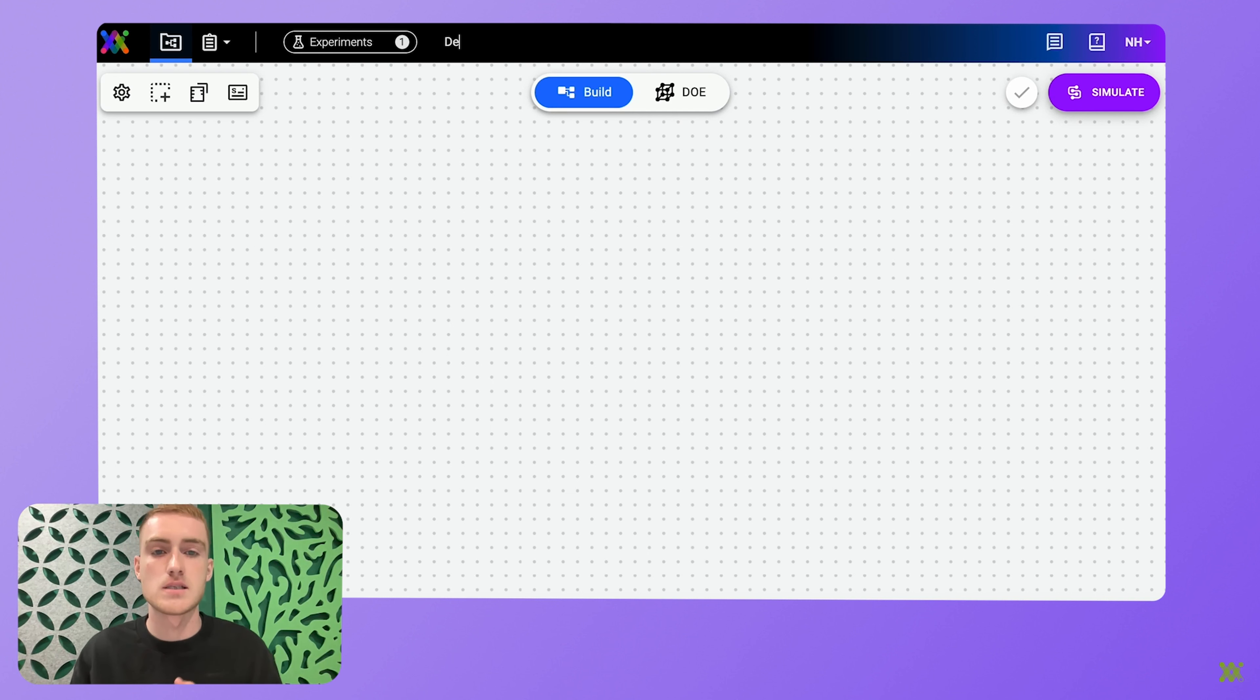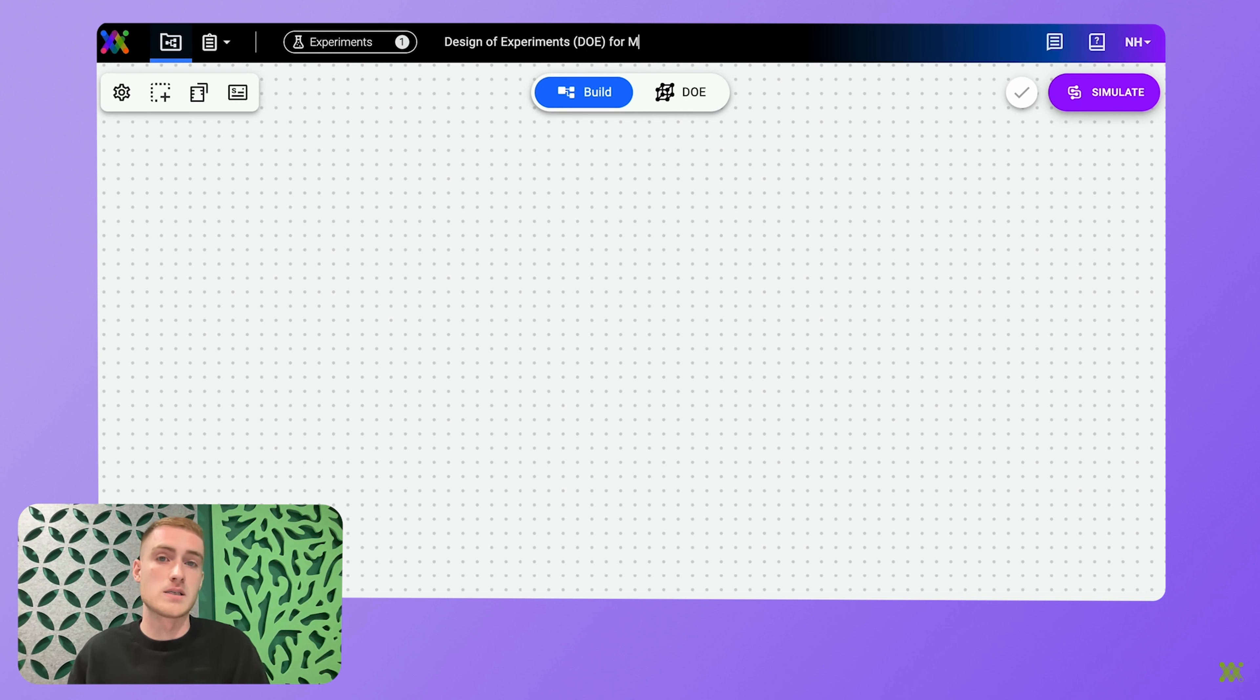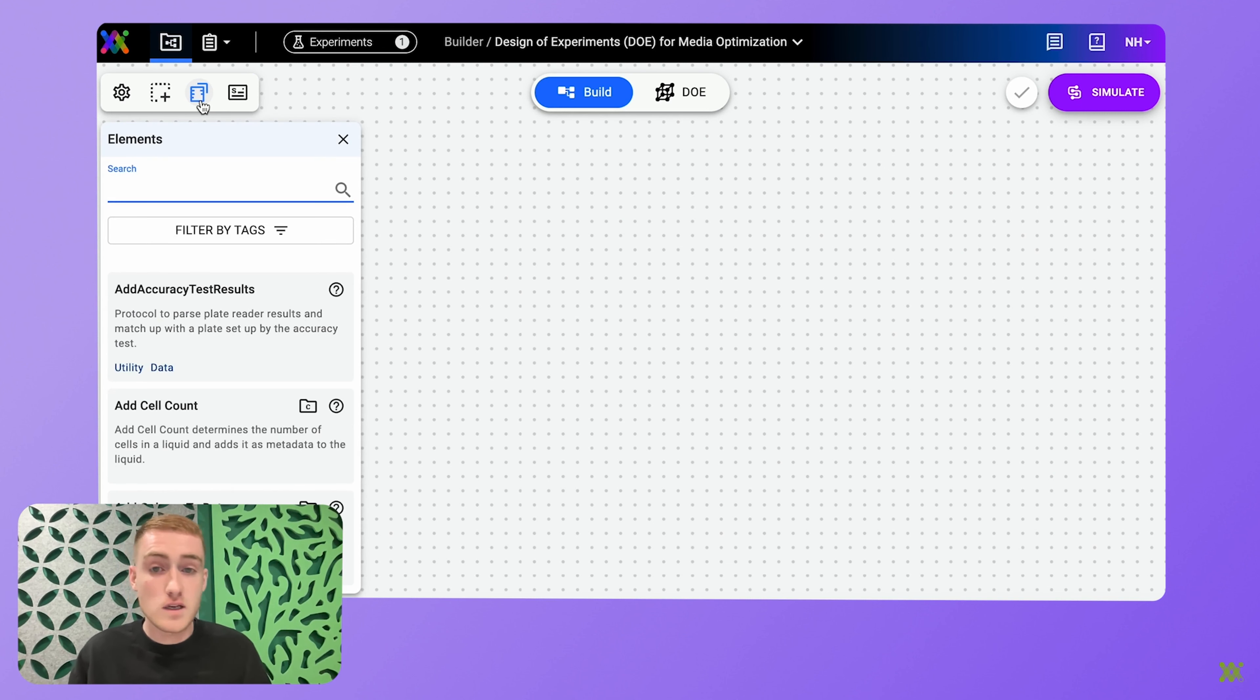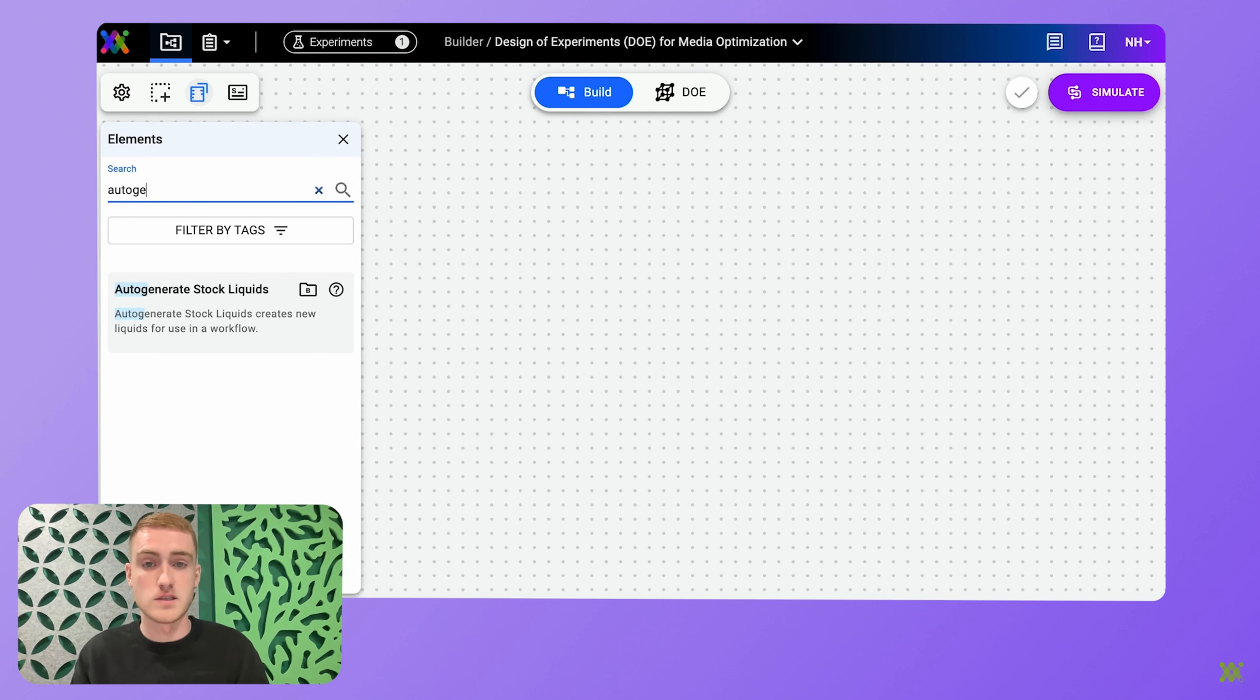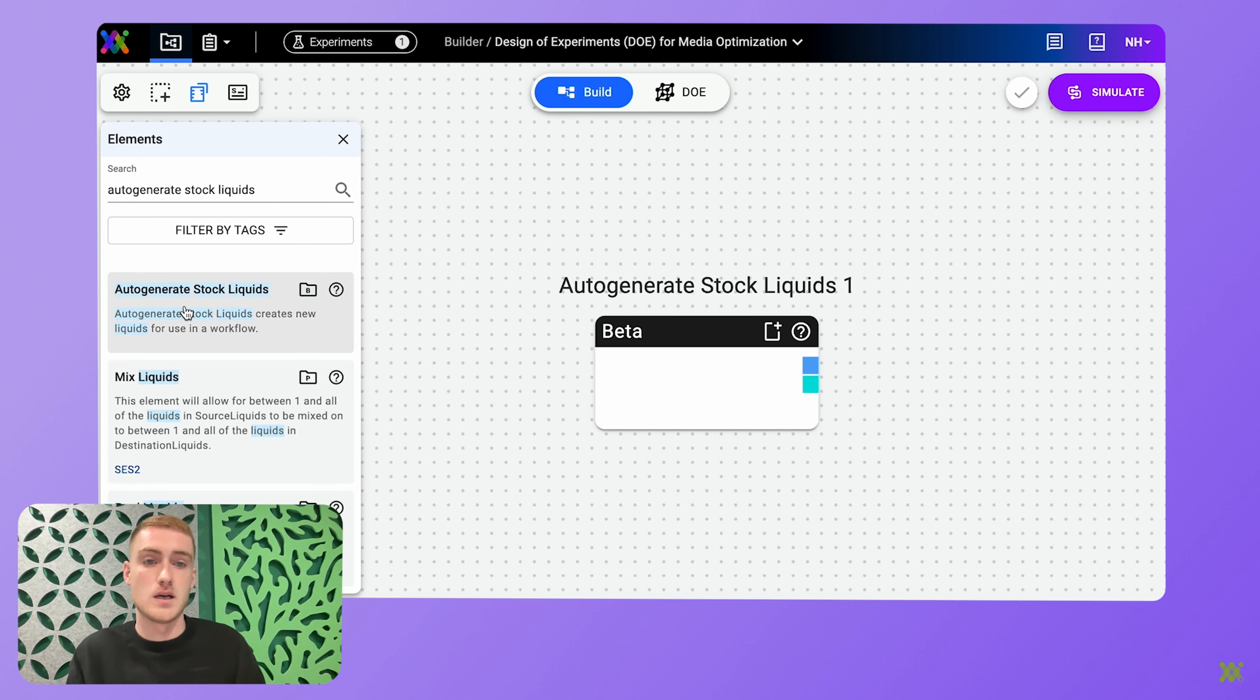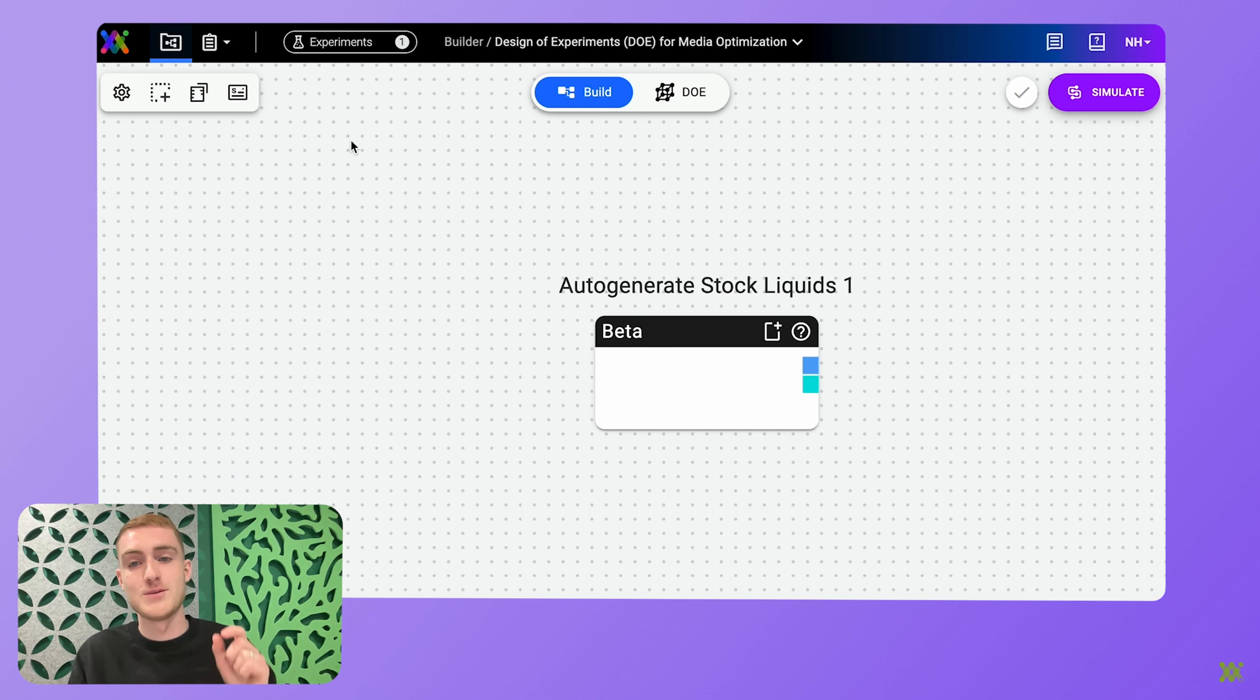So I've taken this simple example where I'm designing a DOE experiment to optimize my mammalian cell growth media. So first, I define my stock liquids that I'm going to make my media from.